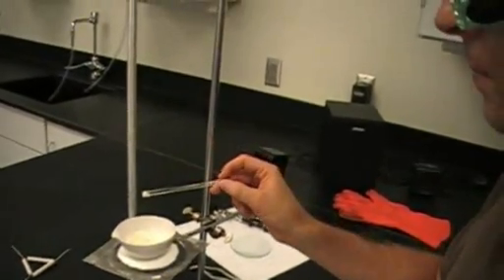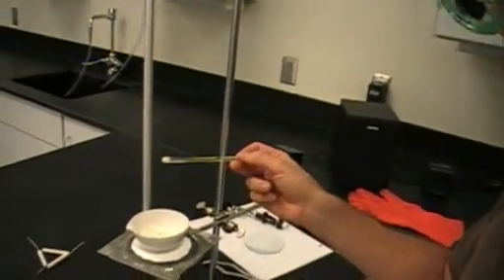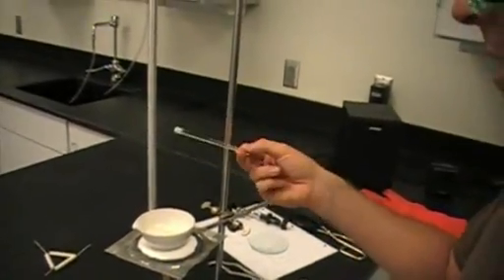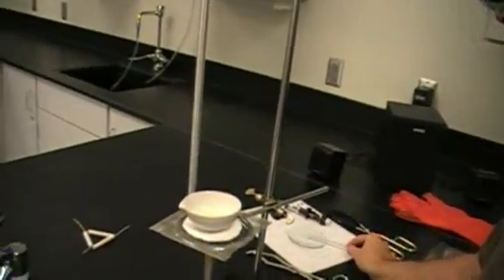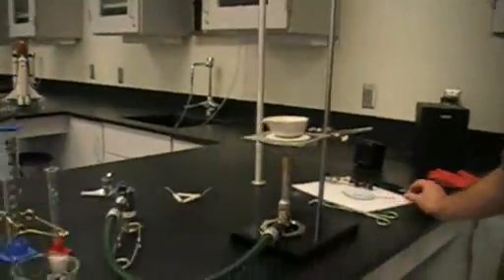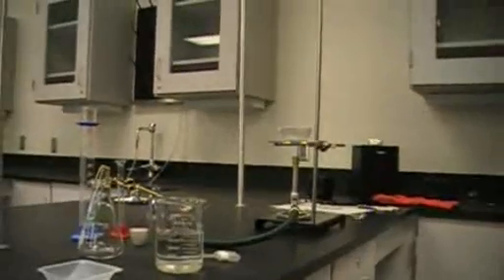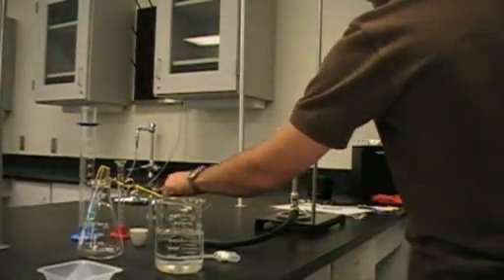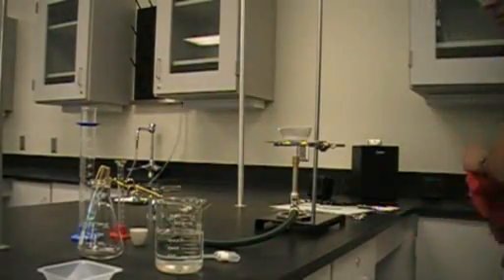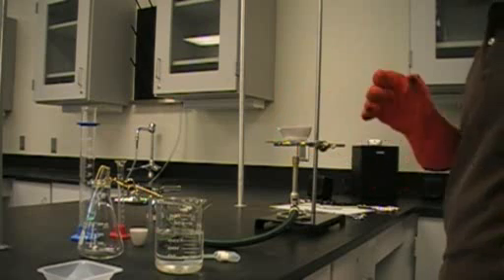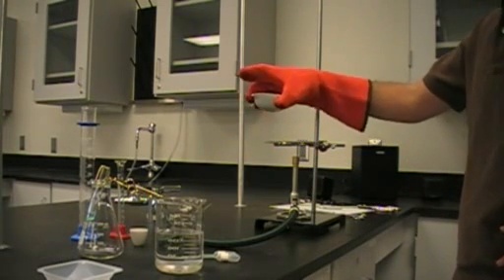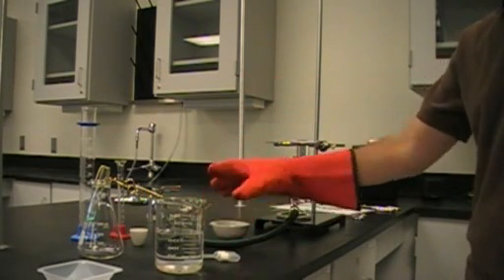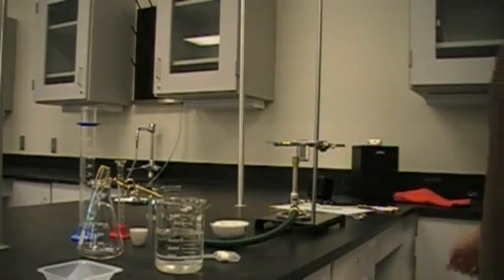So anyways, a stir rod is what this is called. A glass rod, somewhere along those. And then lastly, what we are going to do. This is not one of the pieces of equipment that you need to know. But let's say this was done, it is not complete. But we do have safety gloves, just heat resistant. They are not flame resistant. But again, it should get set on the counter. And our black counters are heat resistant always.